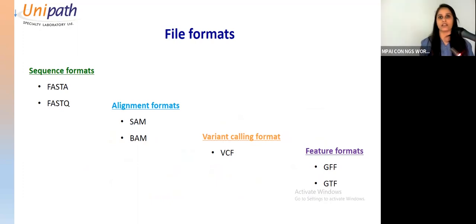So we talked about how we get FASTQ after demultiplexing, right? So you have a FASTQ file. Previously, with most of the sequencers, like Roche and all, you used to get a FASTA file, but now we have FASTQ files. Once you have a FASTQ file with you, we filter it to remove the adapter and low quality sequence. After that, we take the reference genome and map on it. That is the basic step of all the analysis. As we have a reference, we map on it, right?